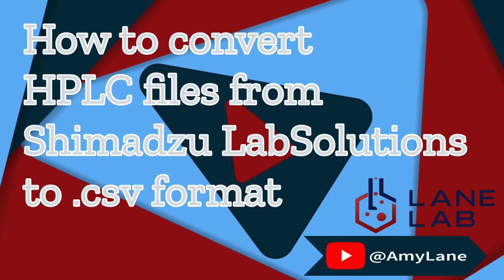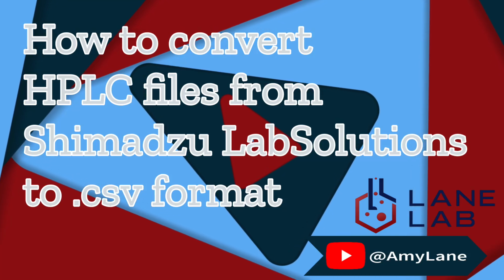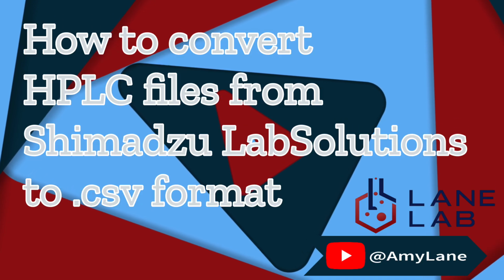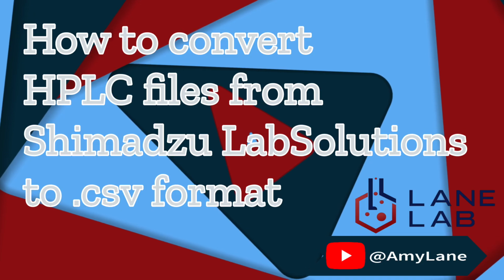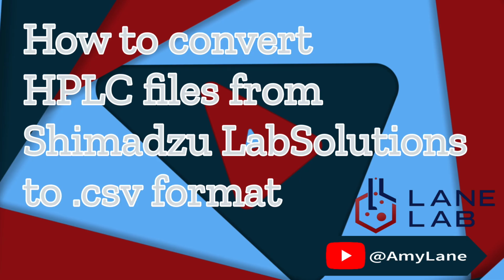In this video, I'm going to show you how to take a LabSolutions HPLC data file and export that as a .csv or .txt file that you can then open in Excel or other programs that allow you to make nice plots and publication quality images. Let's go ahead and get started.